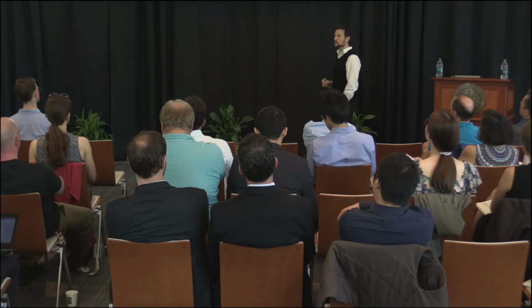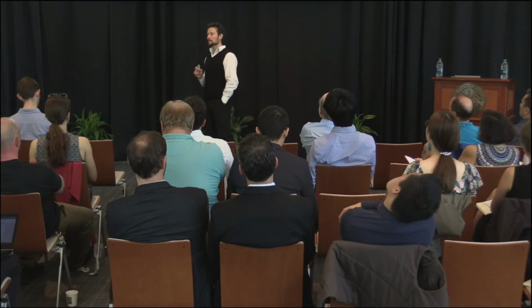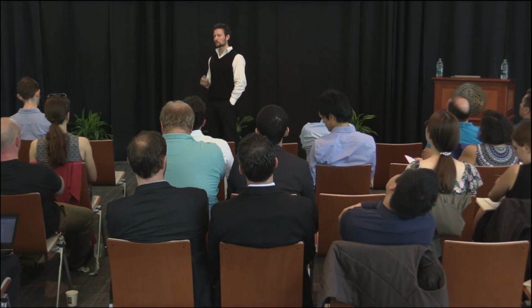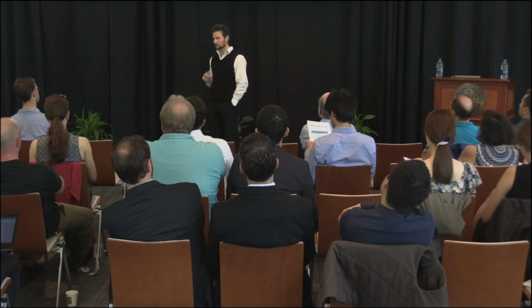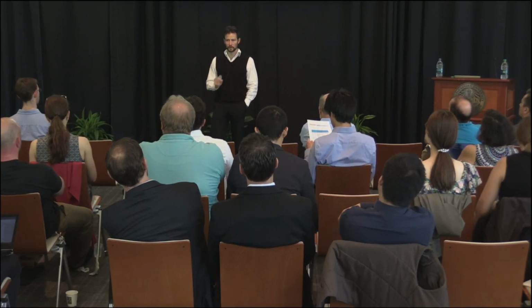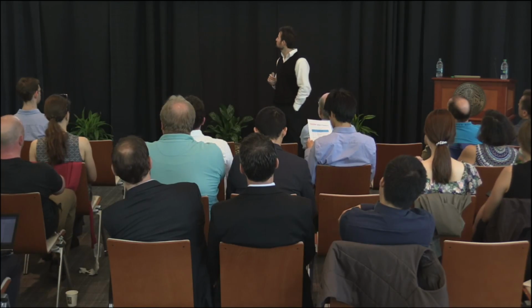So how can we know that we can do quantitation? There are more than one ways to evaluate that that I'm going to show you, and I think this should be a major question of discussion for all of us. We shouldn't just take it for granted that because bulk proteomics is quantitative, we can just do the same thing, and single-cell proteomics will be as quantitative. So benchmarking, rigorous benchmarking, I think should be one of the important aspects that this community establishes.